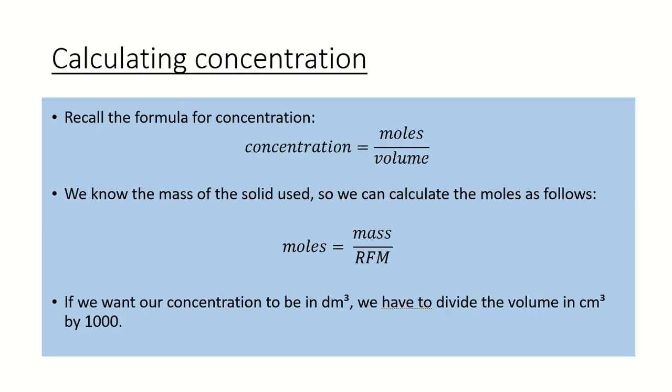So, what do we want at the end of this? Well, we're making a standard solution, so we're going to need to know its concentration. To do that, we're going to have to recall the formula for concentration, which is moles over volume. Then I'd think, what part of that do I have?